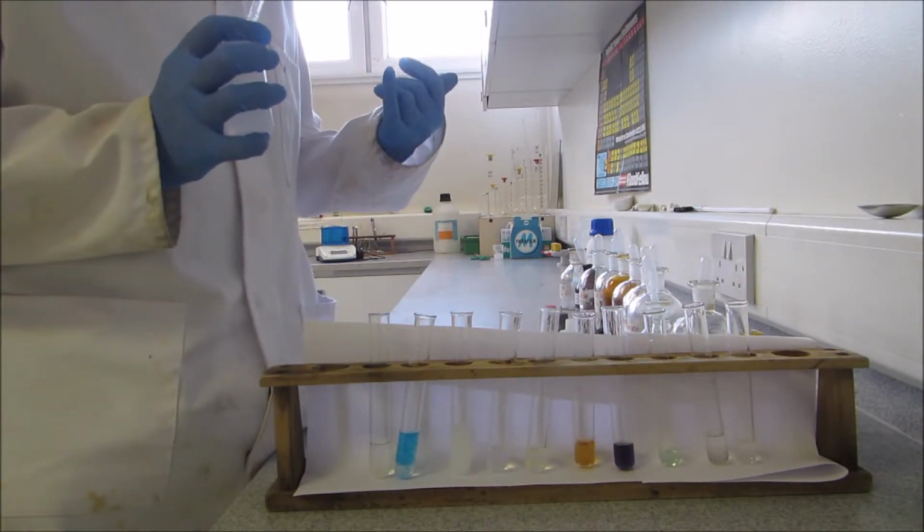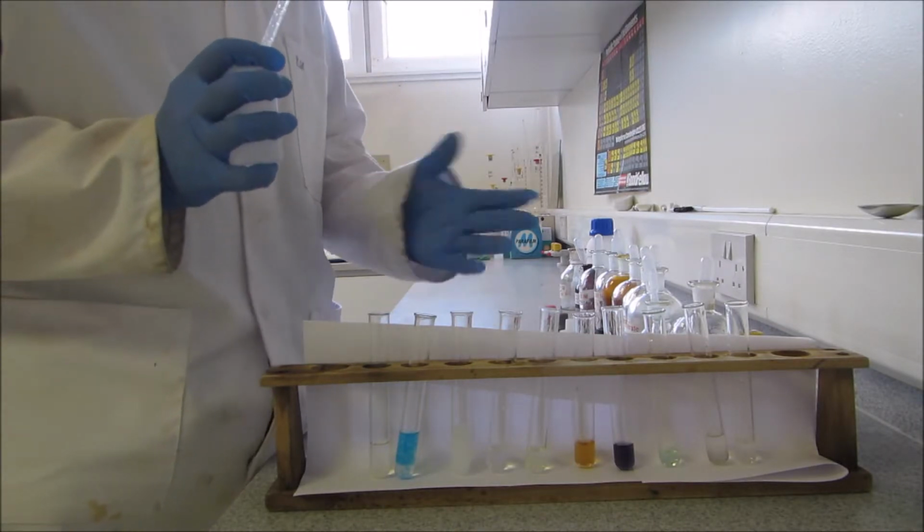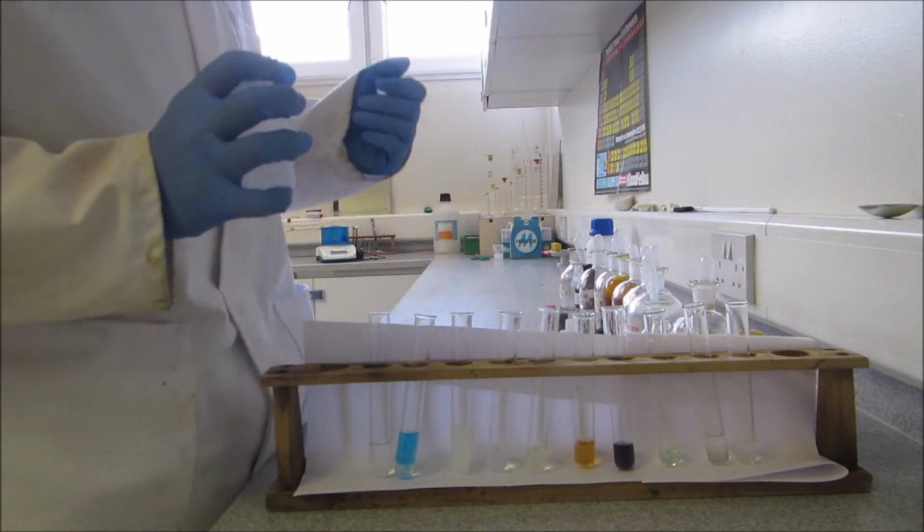and the cation could be magnesium, calcium, or barium. To identify, again, I'd have to use a flame test, so because it's calcium it would show a brick red flame.